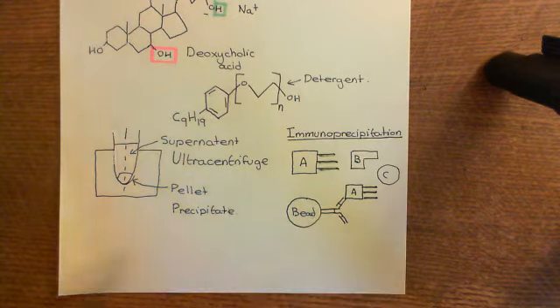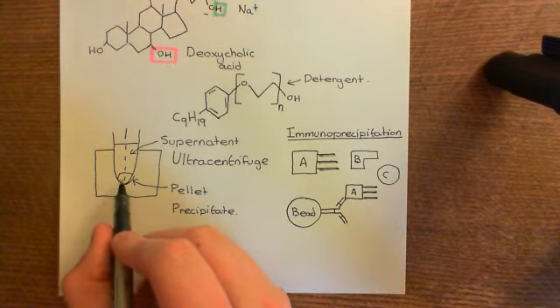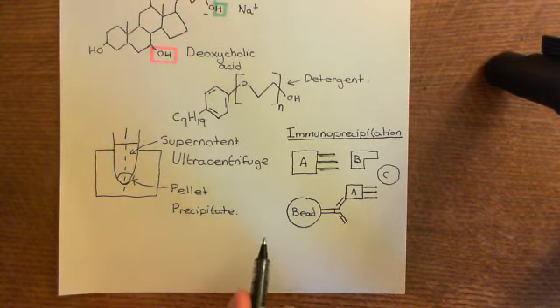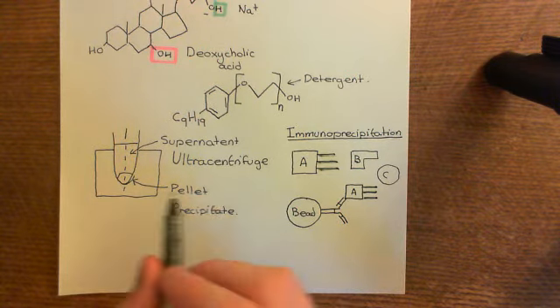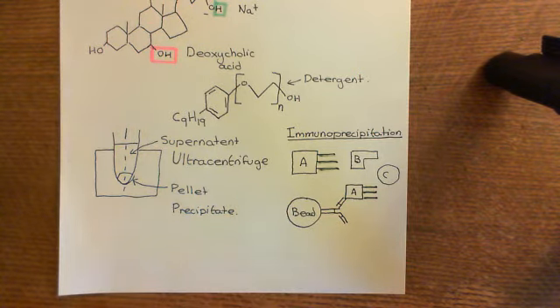So this technique of separating protein A from the other proteins within that solution by antibodies attached to beads is called immunoprecipitation. Then what you will do is take this pellet out and examine the pellet for radioactivity. If you can find a radioactive signal from the pellet, then you know that protein A has got these palmitic acid molecules bound to it, which are radioactively labelled, and therefore protein A must have been palmitoylated.